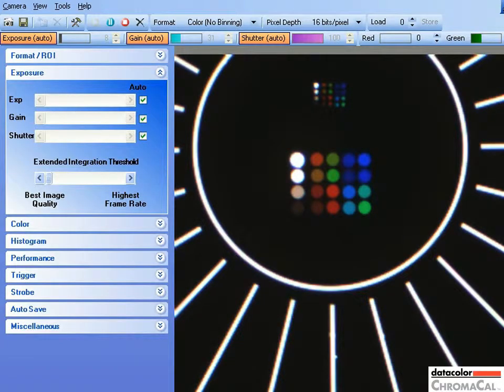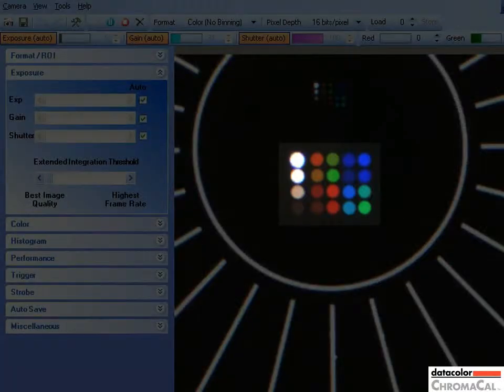The size of the matrix need not take up the entire screen, but use the largest matrix where all 20 spots are visible. Now here's what is seen on a computer screen in this version of camera software. Note that the orientation of the color matrix doesn't matter.